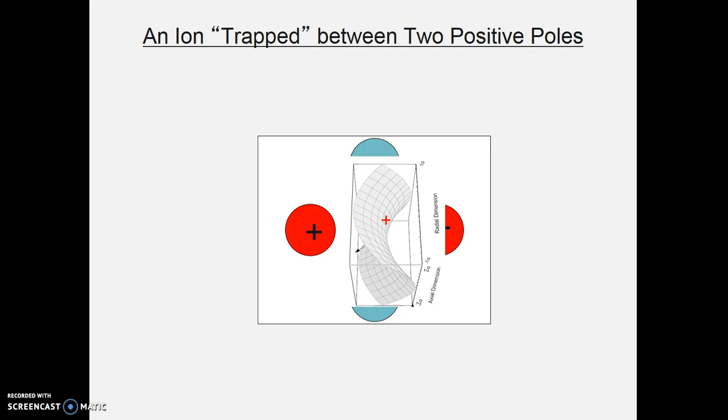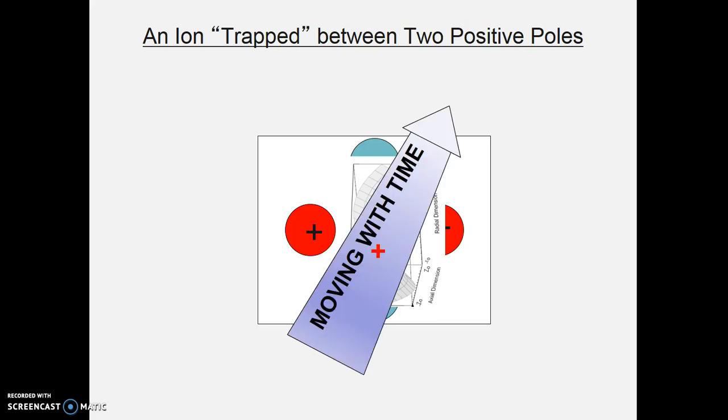Okay. Now look at, you're seeing your saddle potential, and it's reoriented because the polarity is reoriented. We have switched the polarity. That means the charge of our individual rods. Now, that's just a cross section, but this is going through time. And so remember, this thing is moving in and out of the screen at a certain direction. And so you're looking at the XY direction, that's the field of the screen, but in the Z direction, it's actually doing all this crazy stuff. Whoa, it's going X, Y, Z, and it's moving back further with time, okay?